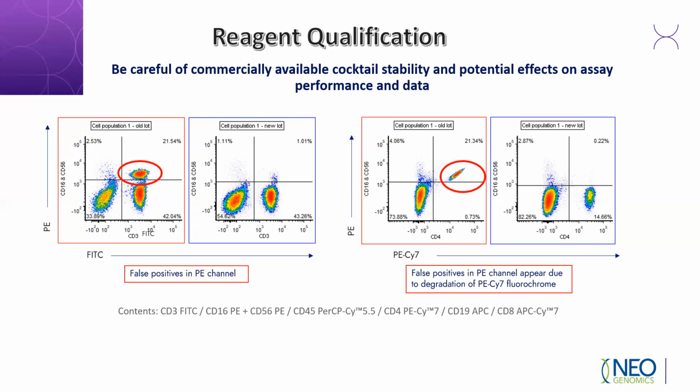One thing that can help identify this is the use of control cells. While that's not a primary topic of conversation, it is a very useful tool in determining consistency of results throughout the course of the study.